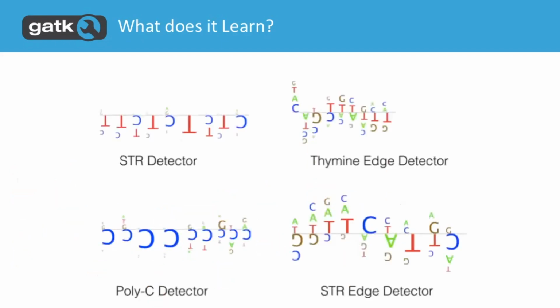So this is an example of some of the motifs that the architecture found in training, and this is kind of reaffirming because we found the motifs that we knew previously to be important with respect to how hard it is to find variants and how sure we are that those variants are real in these regions.